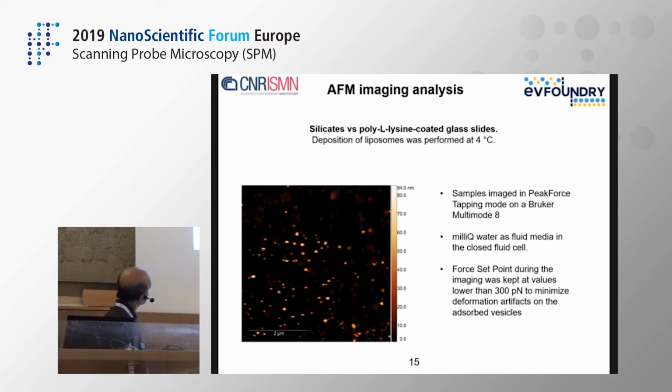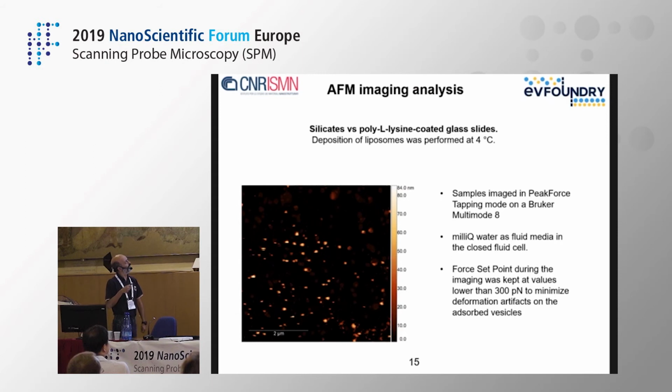I will not go through all the trials that we have done, but we ended up, in the struggle between silicates such as mica and silicon oxide, with polylysine coated glass slides. And I have to tell you that concerning the data that I'm showing you, this is still the best solution that you can find. But we have some issues nowadays, so it's actually a delicate protocol, because the glass and the preparation of polylysine might affect the results. So you really have to find an accurate way to always be in reproducible conditions.